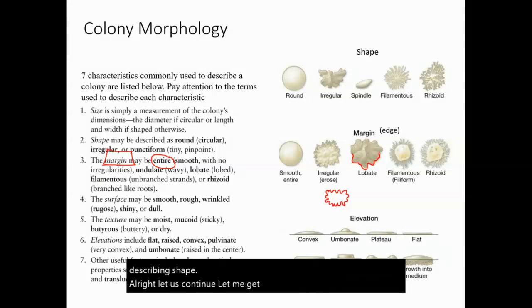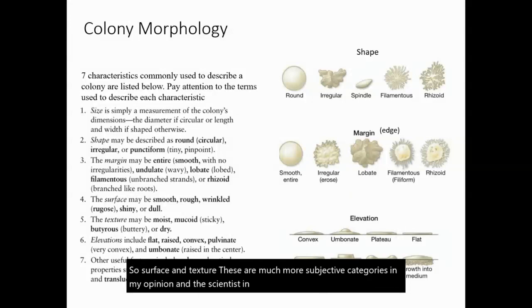Let me get this pen off of here so it's not distracting. Okay, so surface and texture, these are much more subjective categories in my opinion, and the scientist in me doesn't like subjective.